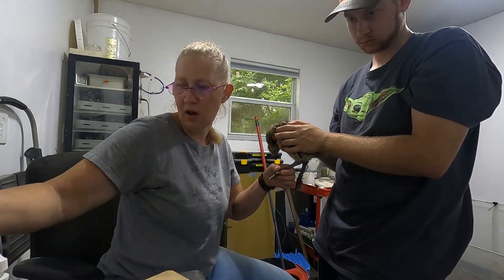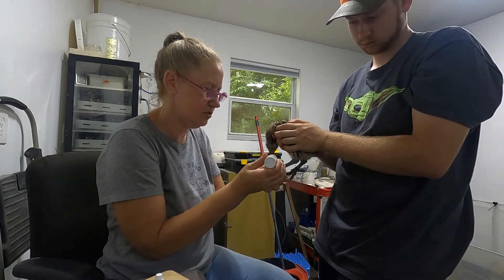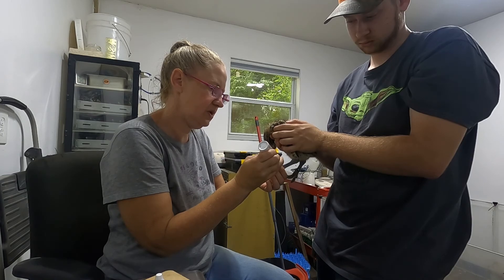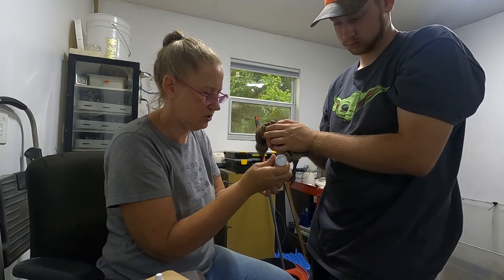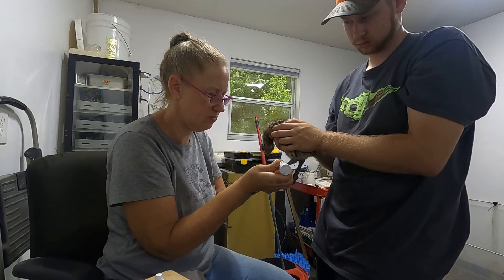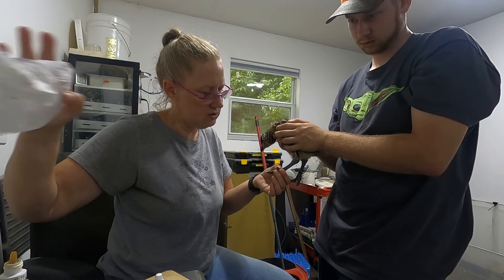These guys are pretty calm this morning. We also just did fresh food and water so they're just kind of chilling. I like to use the styptic gel from Quick Stop. I've found that it actually usually stops the bleeding a little quicker. I use it when I'm trimming goat hooves or even when we're doing the dogs if we have a nail that bleeds.